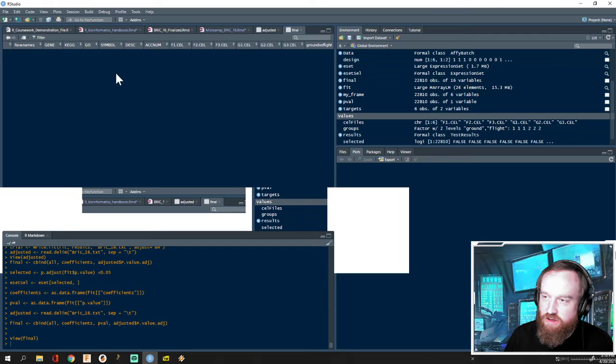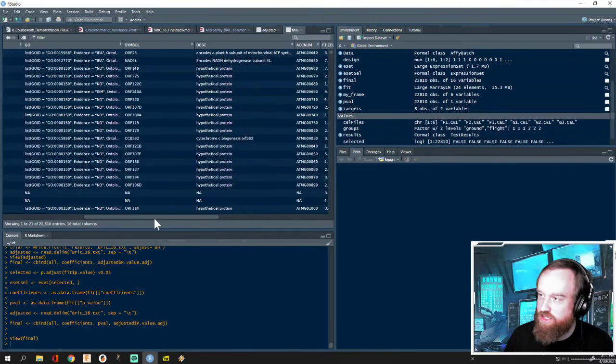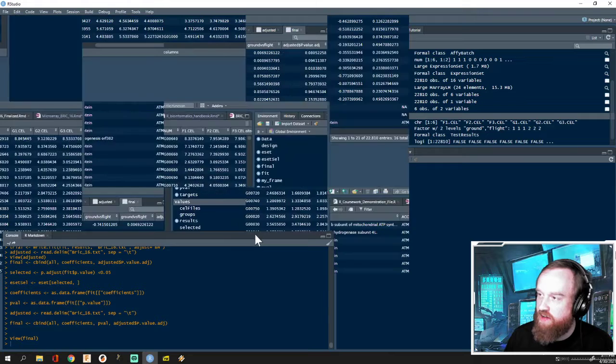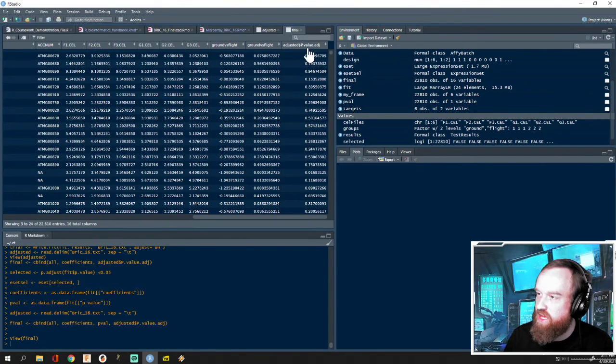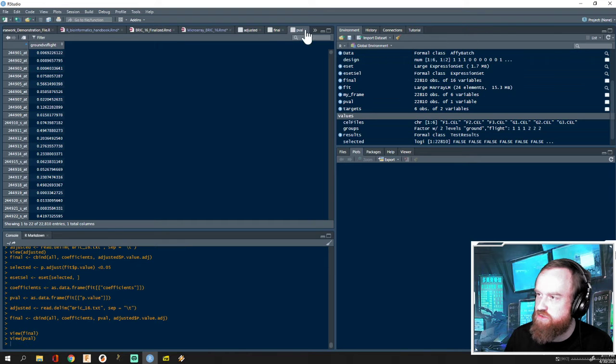All right, so there we go. Our row names, which are the same, we probably didn't need that, but our gene, KEGG, gene ontology, the gene symbol, all this great data, our expression for each individual microarray, and we have our ground versus flight coefficient. I don't know why it glitches like that. And then we have our p-value adjusted. So this is our expression change. This must be our original p-value. Is that from, here's p-value. Look at this real quick, 0.0069.